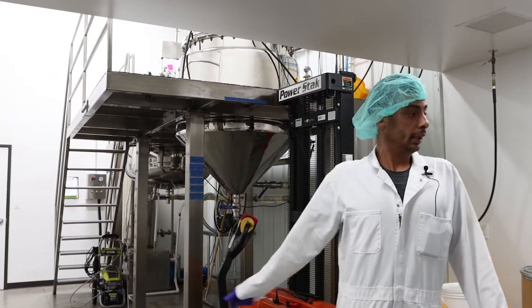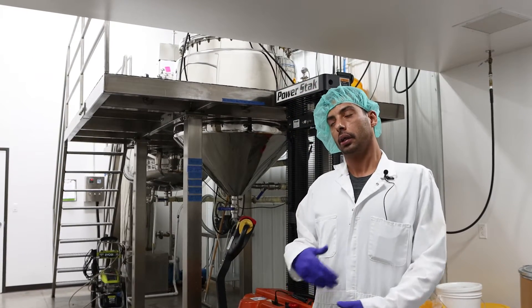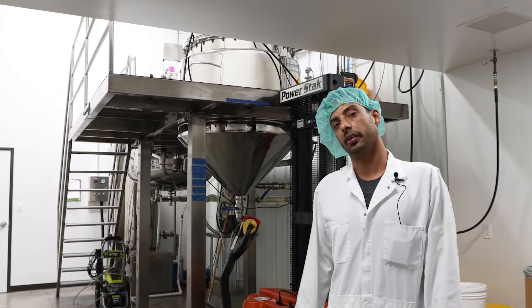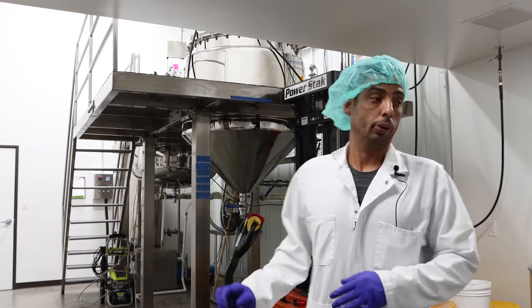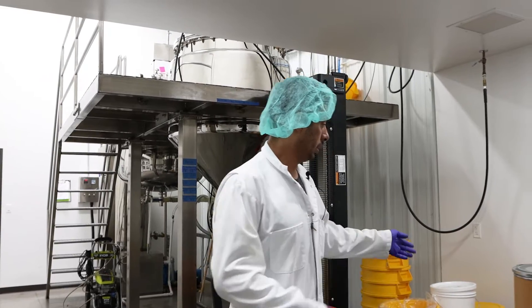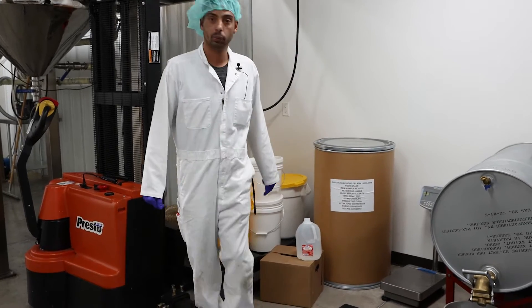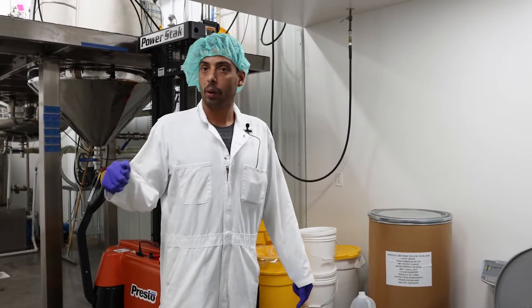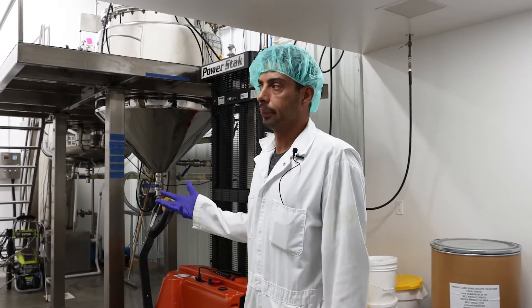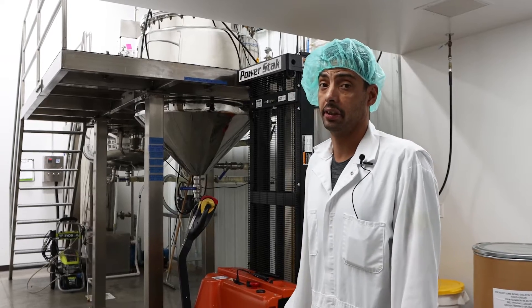We'll let them mix for approximately 15 to 20 minutes until it comes up to a temperature of roughly 75 degrees Celsius. Once we get it towards that point, we will mix in our powder gelatin — right here it's lime bone gelatin, 150 blooms. We'll mix that in per part and let it go for another 15 to 20 minutes until it reaches roughly 78 to 80 degrees Celsius.